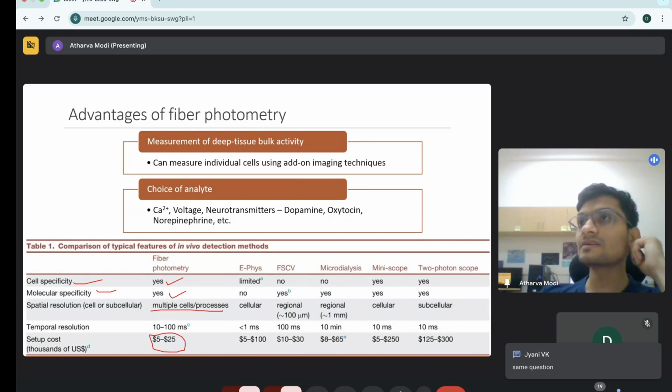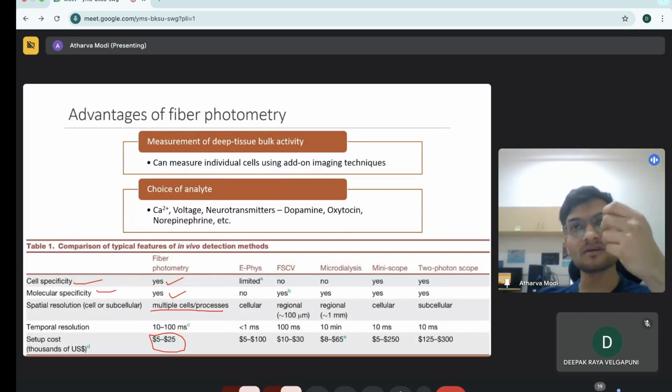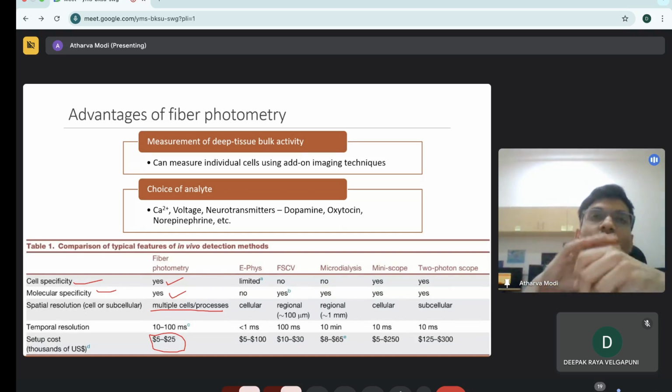Ligand binding to GPCR is essential for emission. What exactly triggered that binding that results in light emission even during muscle movement, etc.? So the thing is that it may not be a signal from the biosensor itself. The movement may create artifacts in your optical fiber that create a false measurement.